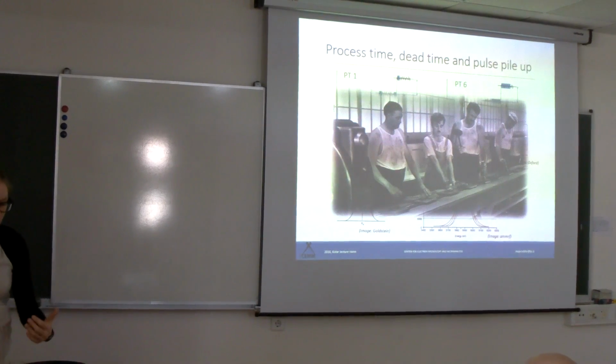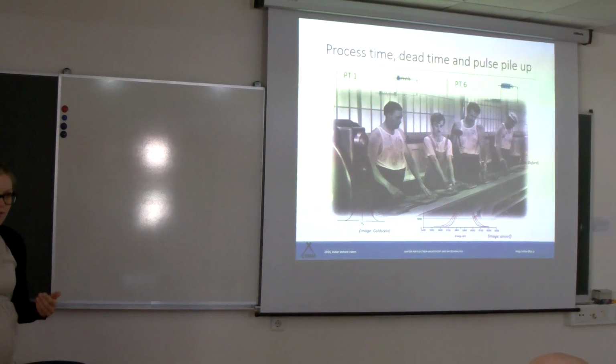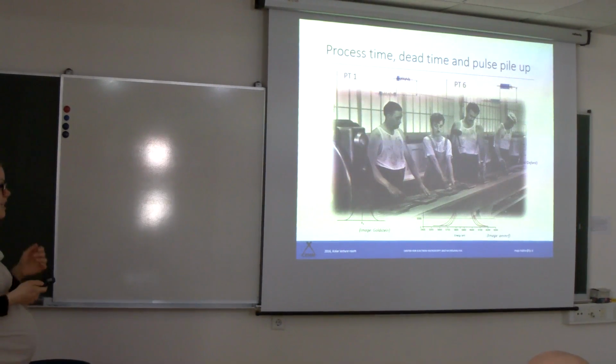So you need to count fast, like 10, okay, this is like 8, this is like, I don't know, 11, you will have a higher error. If it's going really slow, you can count them really properly. So you have a narrower peak. This is how I explain it, but because I have time now, I can explain what's really going on.